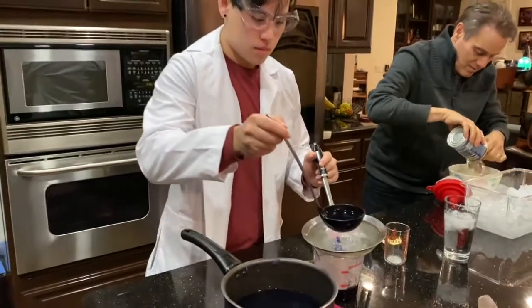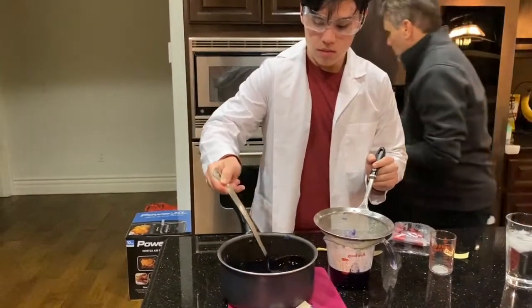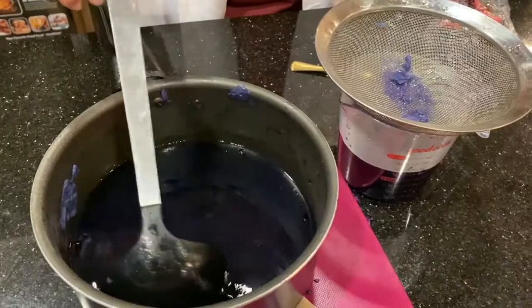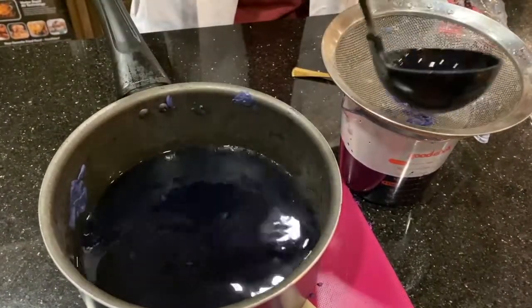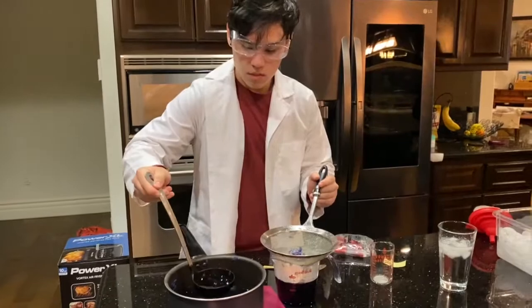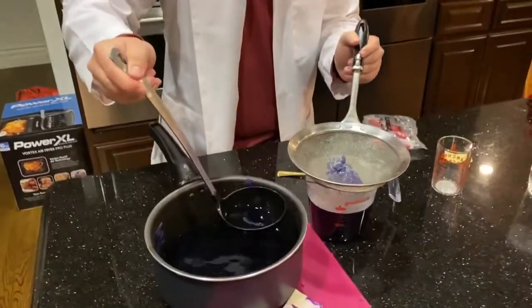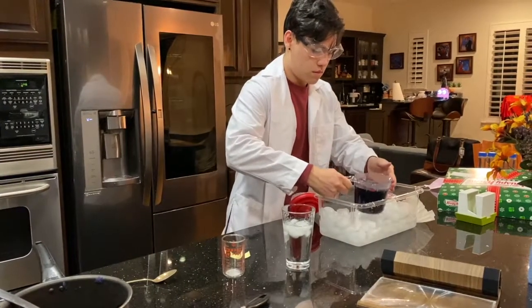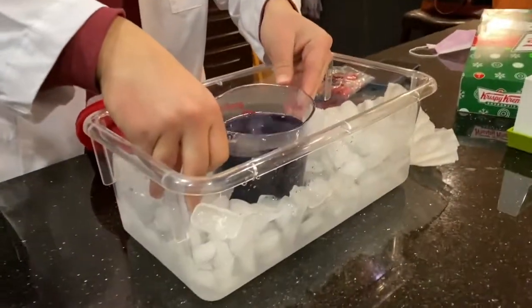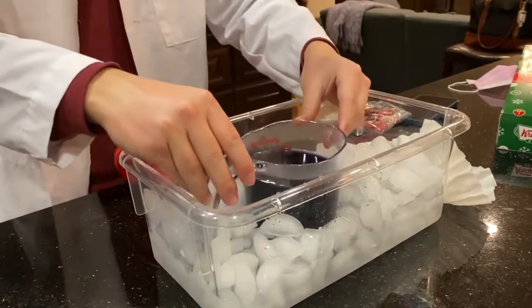We're almost done with the rough filtration. We're going to be putting it in the ice bath soon. The goal of the ice bath is to cool down the entire solution so that the semi-polar groups that don't quite dissolve in water are going to precipitate out. We can then filtrate it one more time with a coffee filter to make sure that only the very polar groups like anthocyanin are going to remain in the solution. Anthocyanin has a lot of hydroxyl groups on it, meaning it's able to hydrogen bond with water very easily, but other impurities that can't form these hydrogen bonds are going to precipitate out when cooled.